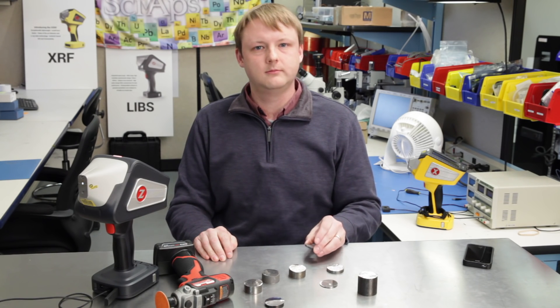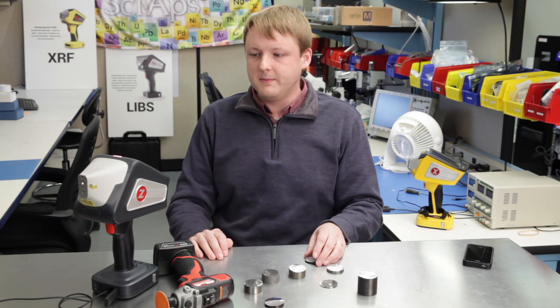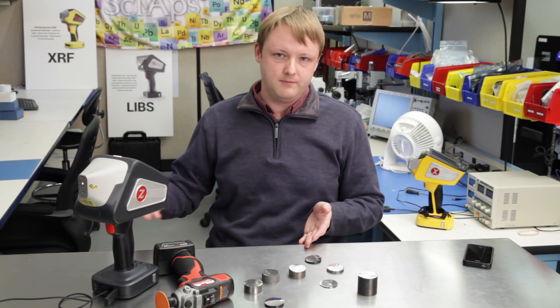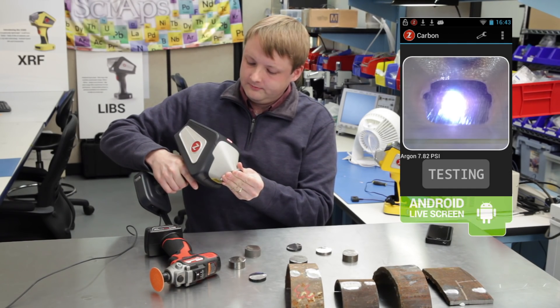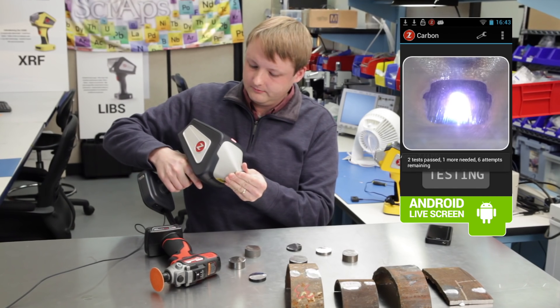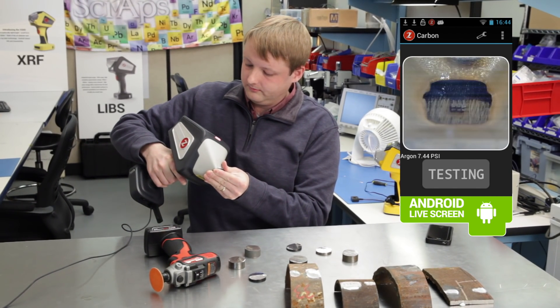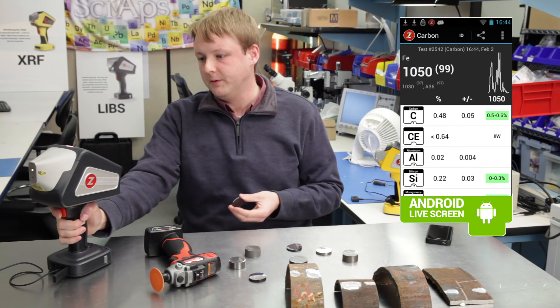The calibration range on this is roughly zero to about one percent carbon. Most of the interest is going to be in separating 1018 from the 1000 series — 1018, 1030, 1050 — and 4130, 4150, but we go up to about 1%. We're testing a 1050, which has half a percent carbon, and we're coming out at about 0.48%. Very good.